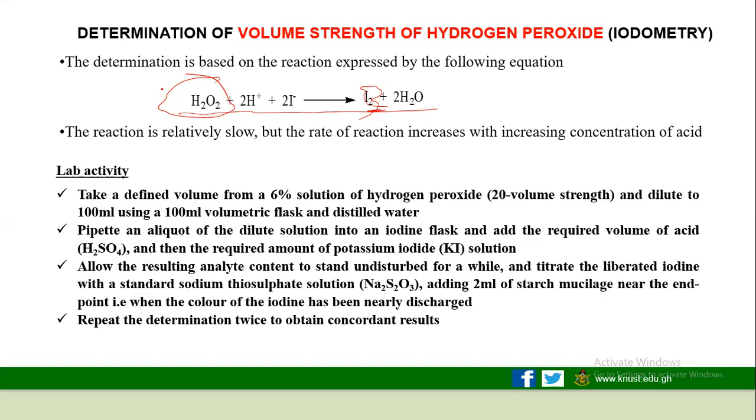So it follows the same rationale that in iodometry, we don't have the iodine upfront, but we can have a reaction of the compound that we are using that will release iodine, and then the iodine released can be reacted against what? The thiosulfate. That is the whole rationale. So this is the first step. The next step is when the iodine reacts with the thiosulfate, and usually the mole ratio that we use in our milliequivalent calculation should be the overall reaction.